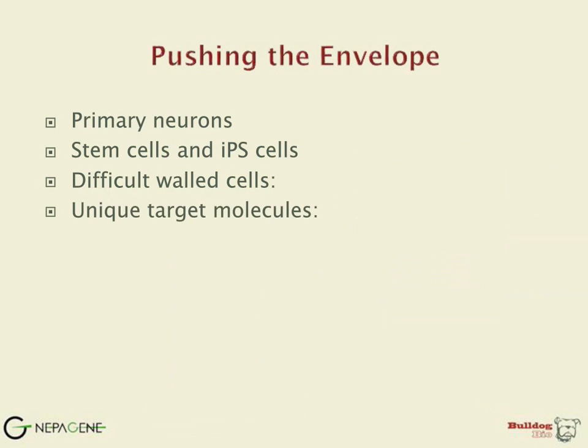As I've touched upon, electrokinetic transfer is not just for DNA. It can work equally well for siRNA and surprisingly is nicely suited for proteins.